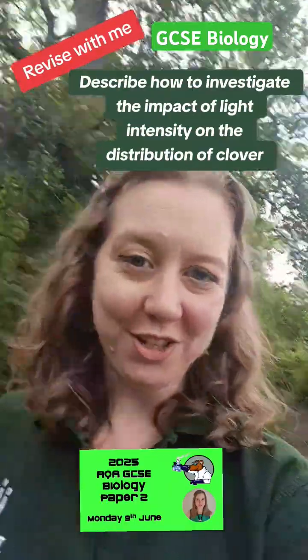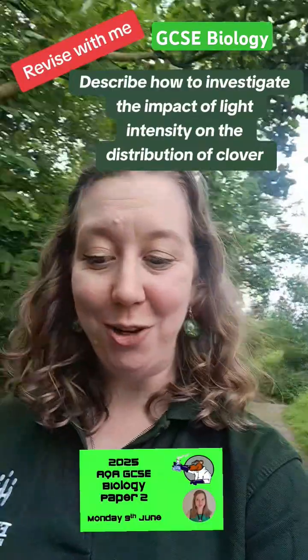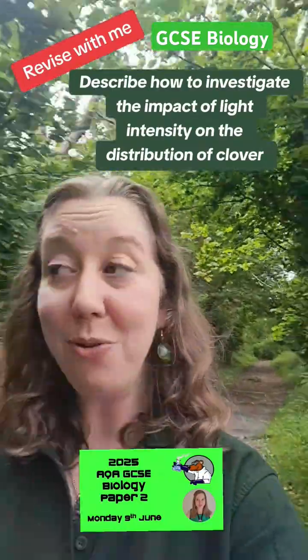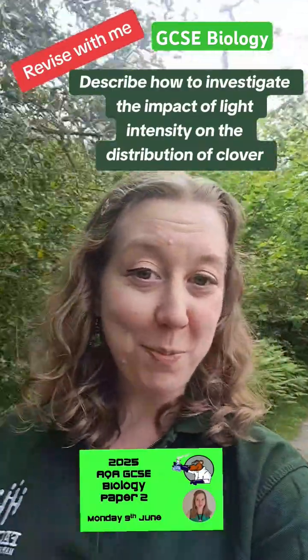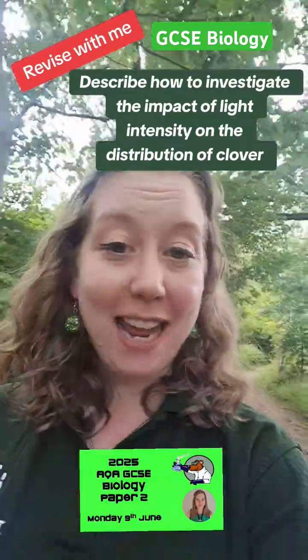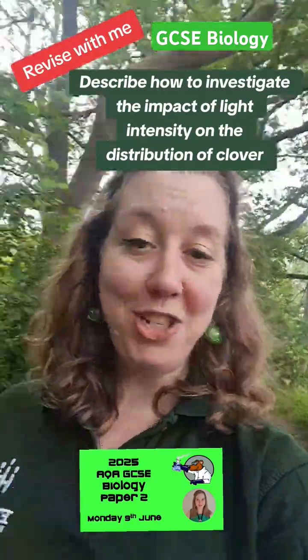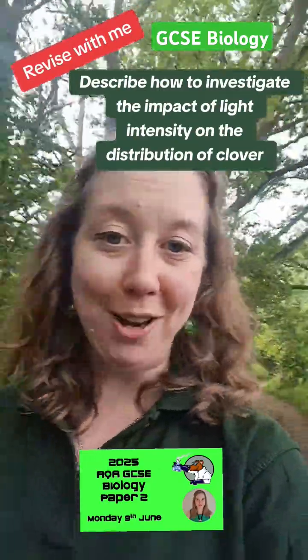Now, there are lots of different versions of this practical. I said we were going to investigate light intensity, so we would need to use a light meter. But you could also investigate pH using a pH probe, or water availability using a moisture probe. And whichever abiotic factor you're investigating, every time you put your quadrat down to count your species, you're also going to measure that abiotic factor.